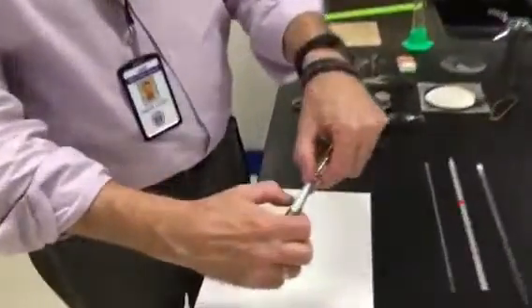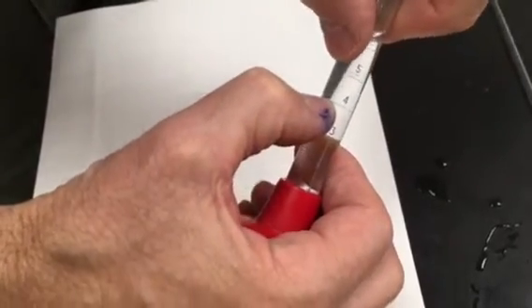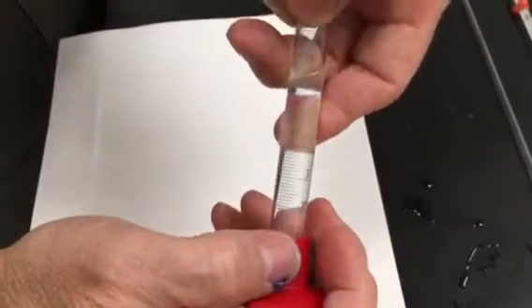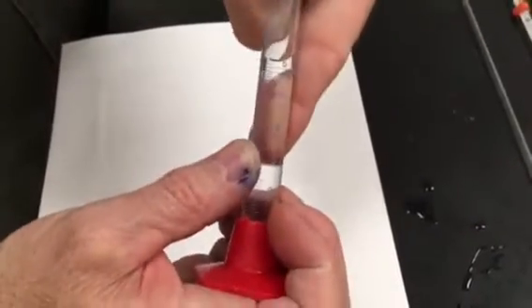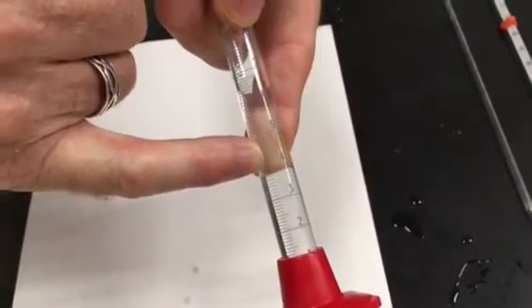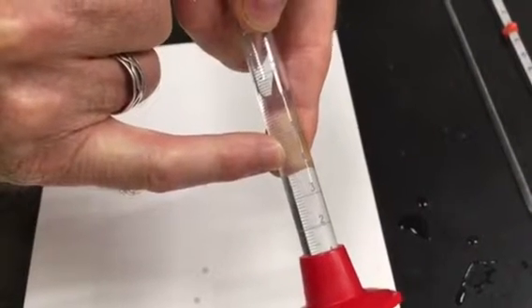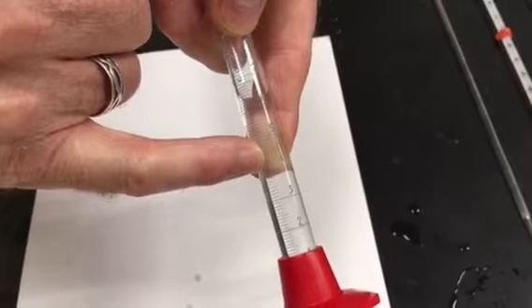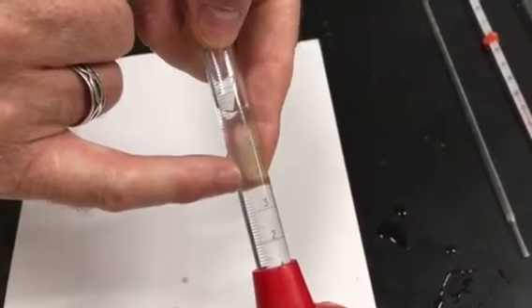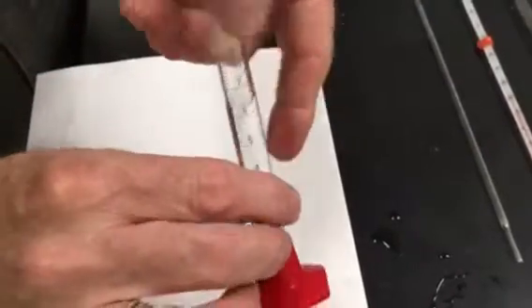Go ahead, Jim. So what I see here, I know exactly where the 4 is. I know exactly where the 5 is. I know where the first hash mark after the 4 is, so that's going to be 4.1. The next hash mark is going to be 4.2. I have a space between those two, and as Mr. Soboleski says, I'm going to guess at that space. So I can get to 2 places after the decimal. I determine that even before I take a reading.